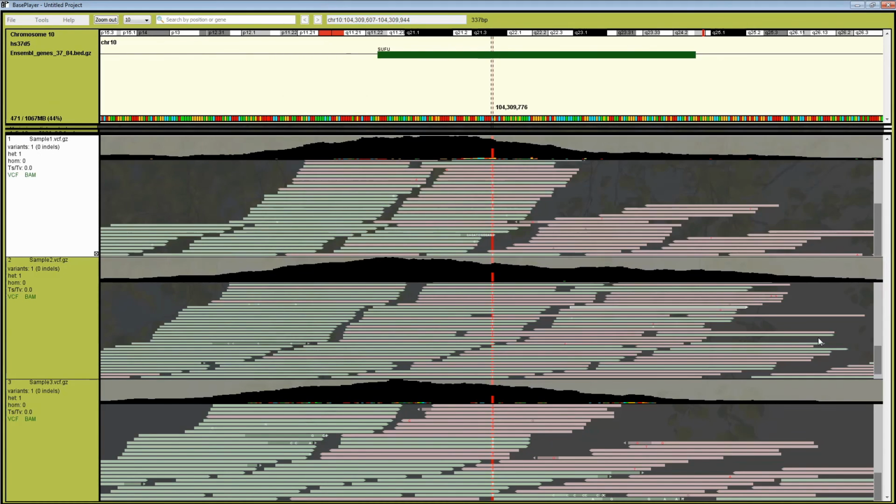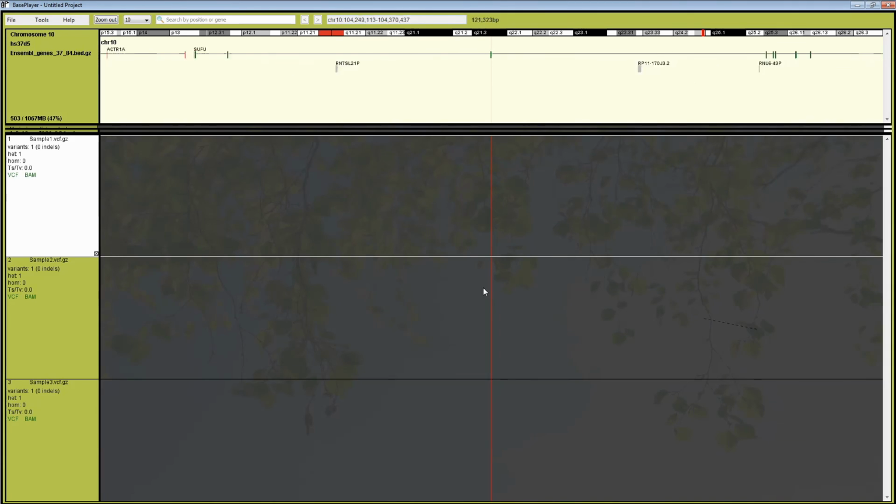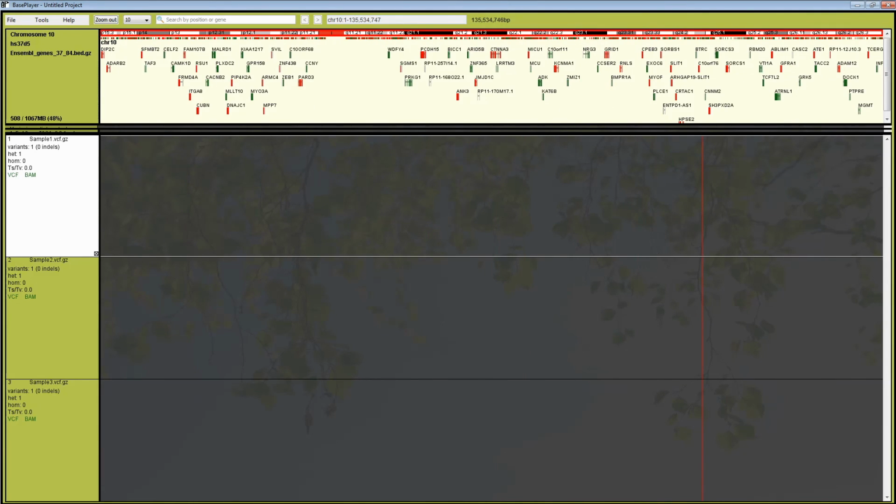So this was actually based on a real study in 2012 by Aavikko et al. You can find the link in the manuscript below.